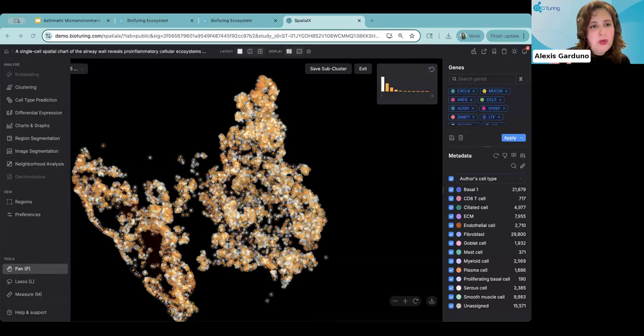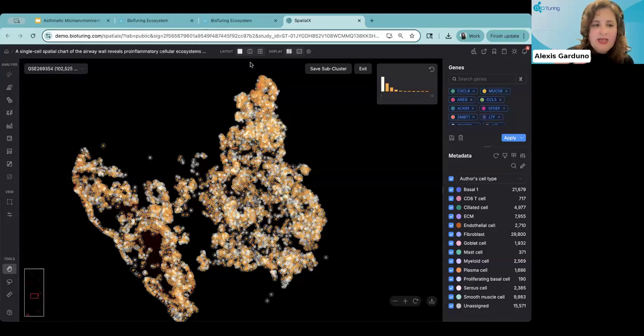And it's a bit different. I do want to make that clear that it's not based on the actual image segmentation. What it's trying to do is look at spatially distinct regions that might contribute some biological understanding. So it might have regions that have this co-localization of certain genes, signature markers that might be relevant to treatment response. And it looks at the spatial pairwise gene correlation analysis within these different regions in the tissue. That's what it's trying to calculate, trying to delineate these distinct biological functions by doing this pairwise gene correlation analysis in the database.